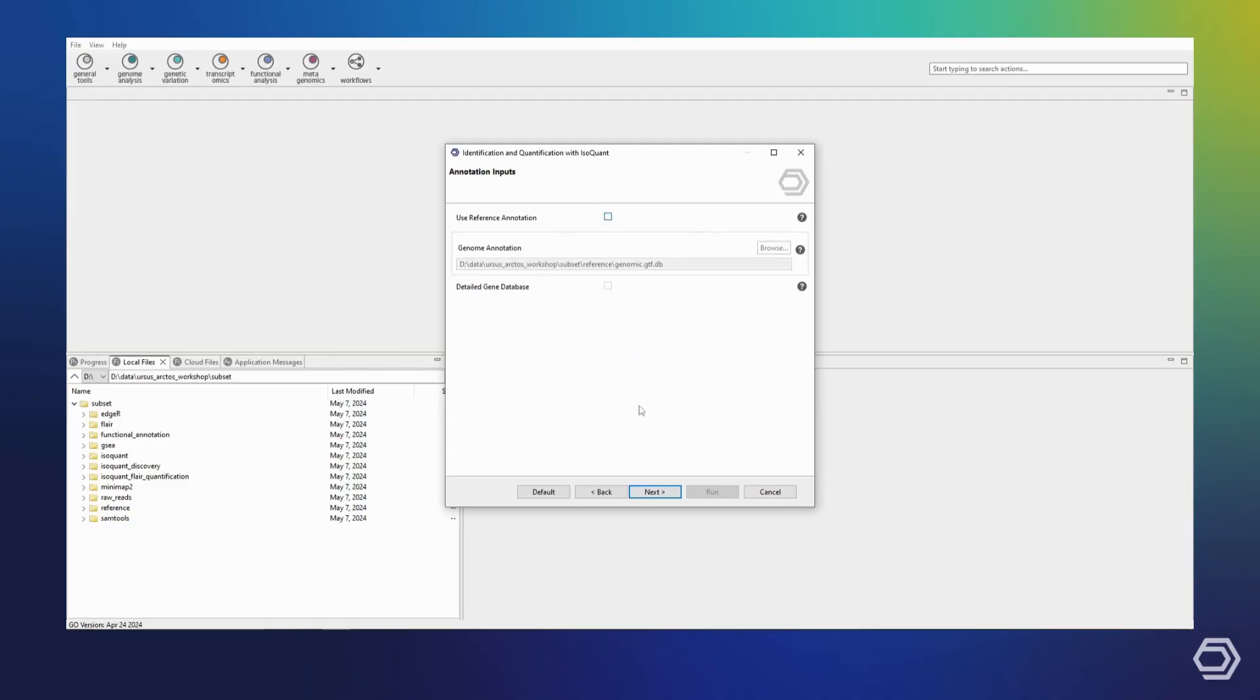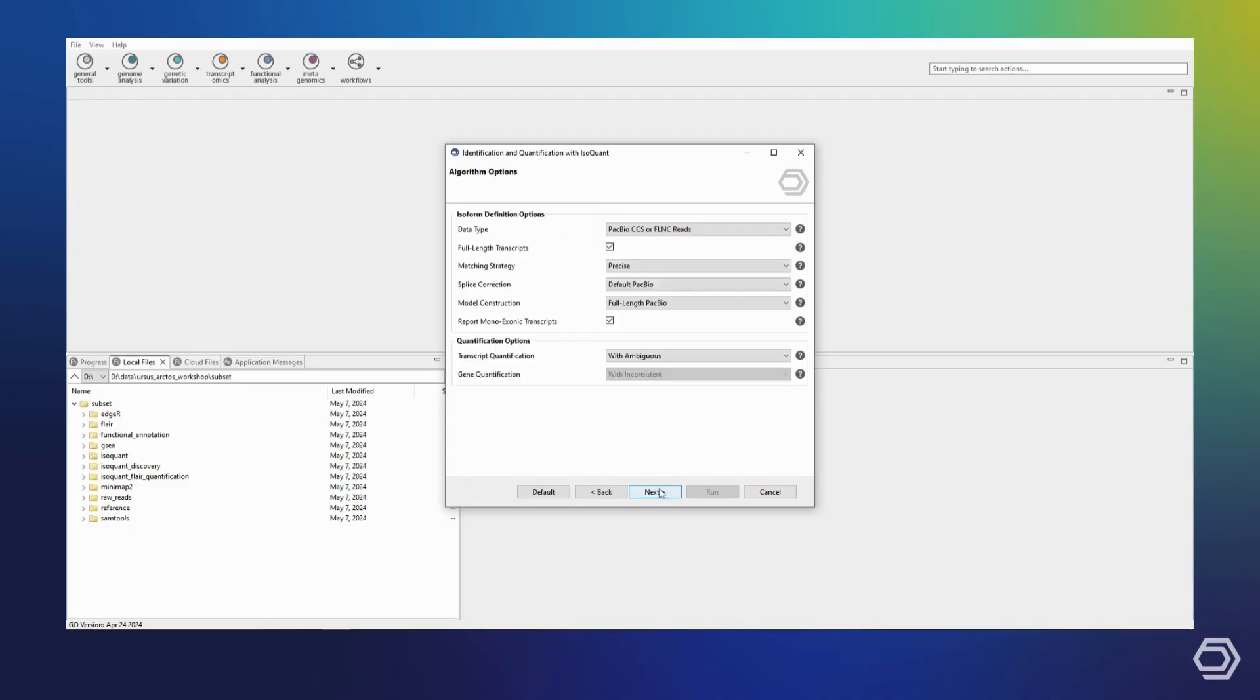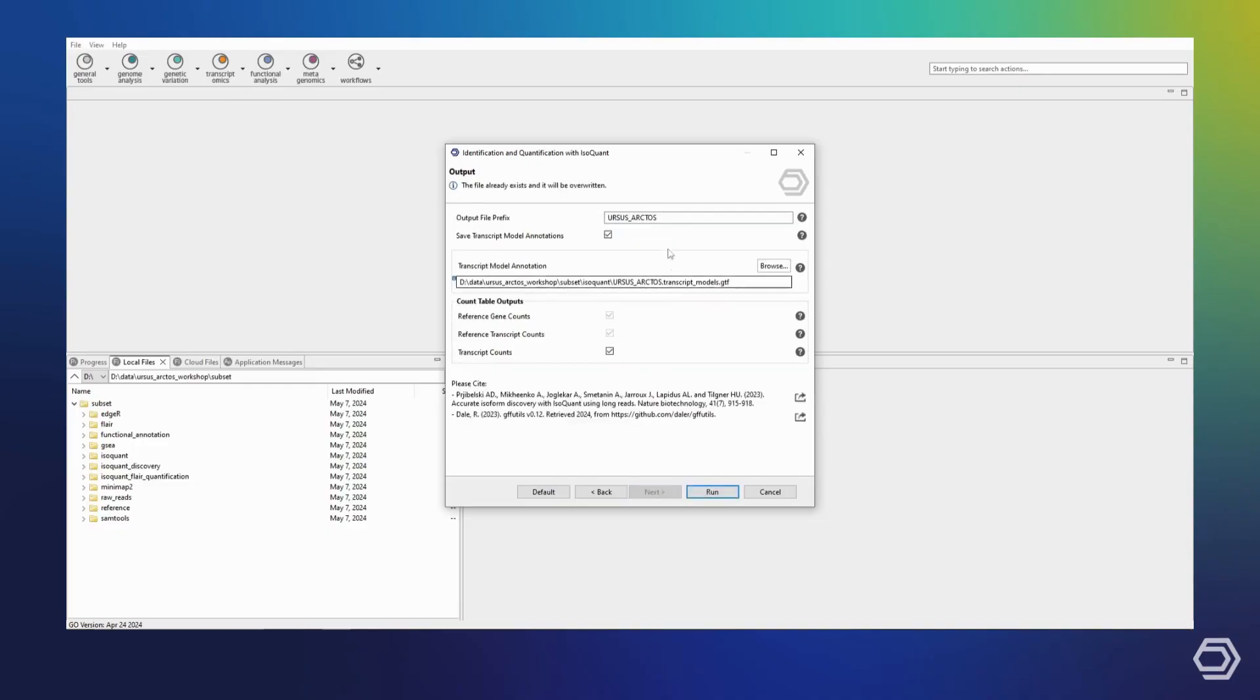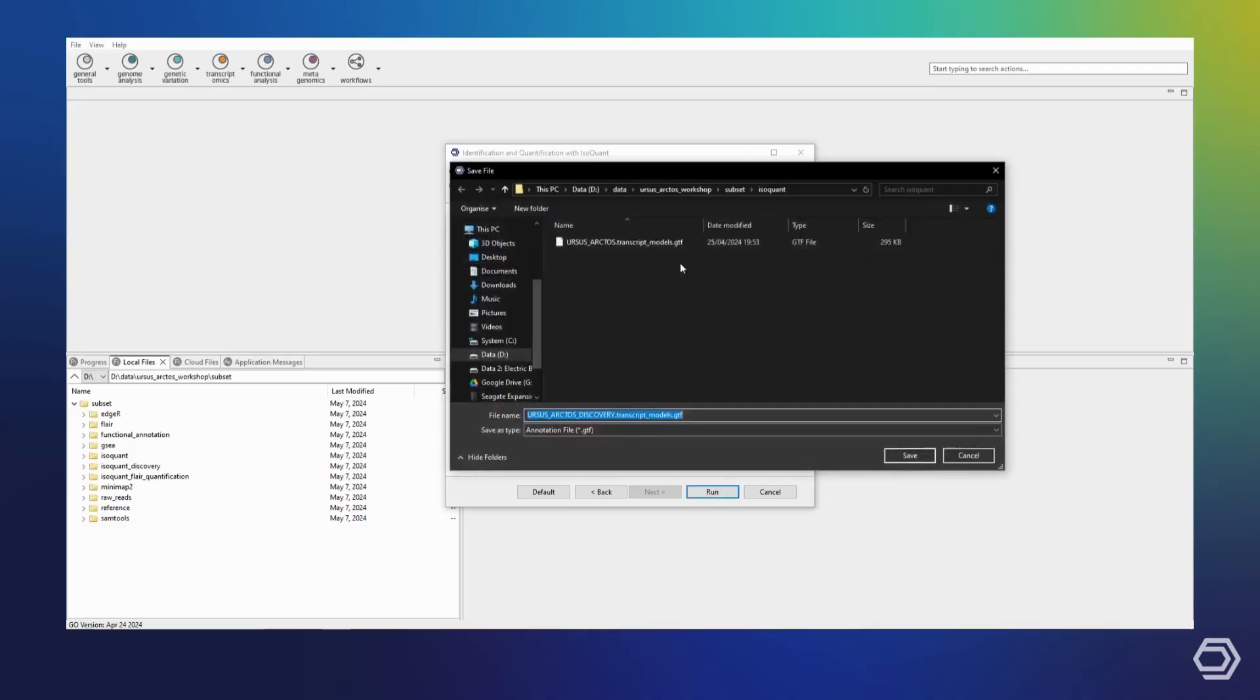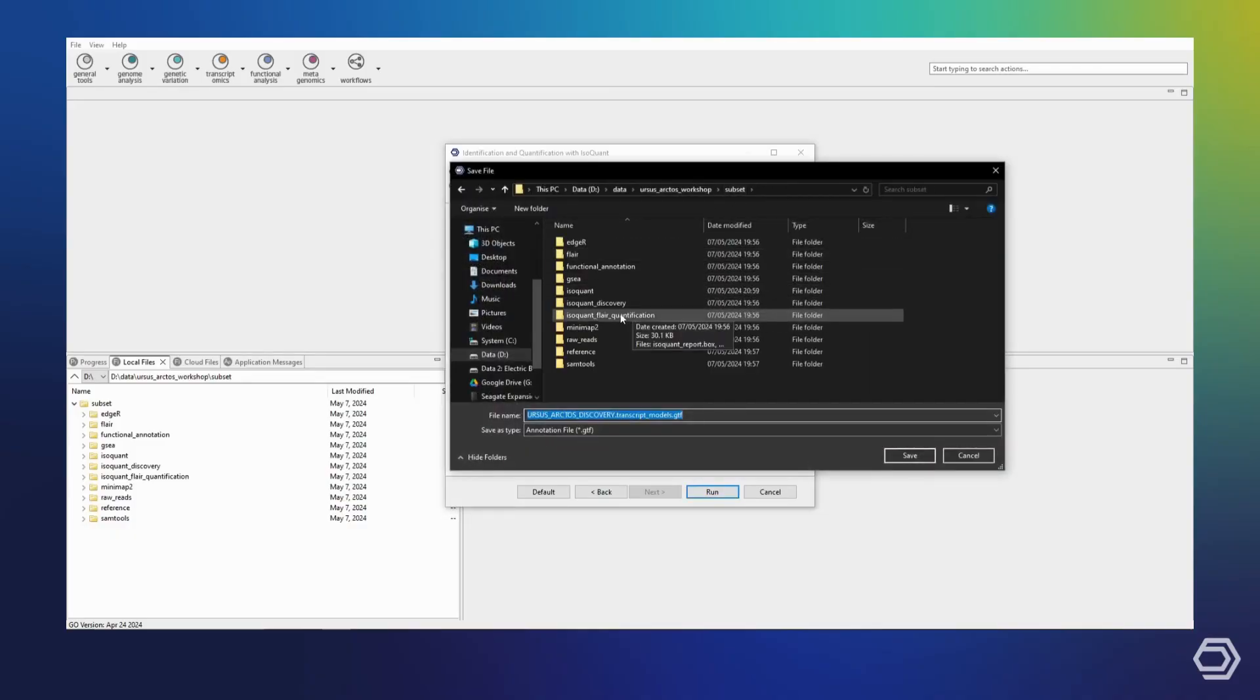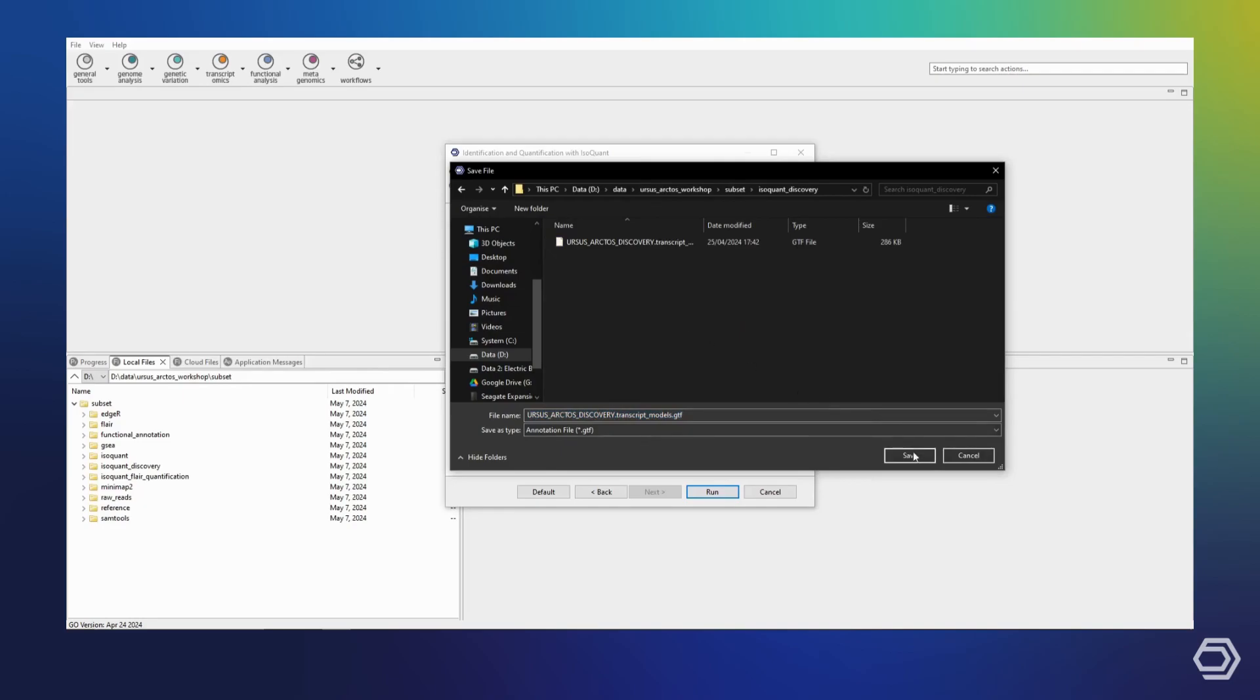We will leave the same algorithm options. And on the last page for the outputs, we will provide a different prefix as well as a different location for our results. You can also see that the reference-based quantification outputs have been disabled.